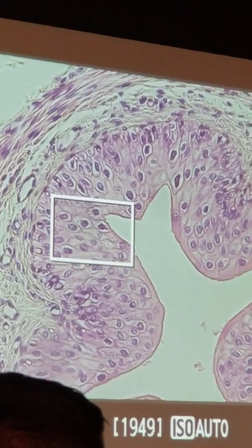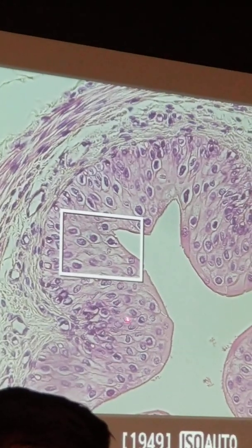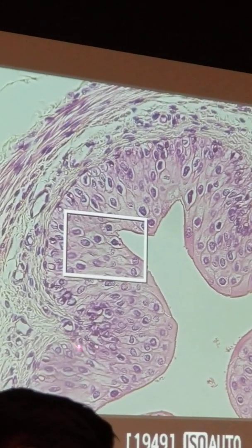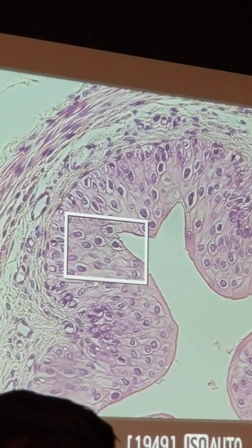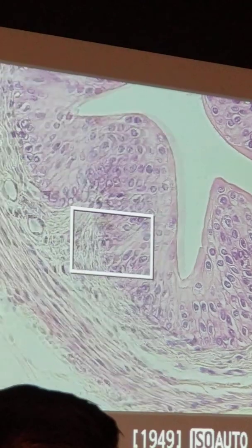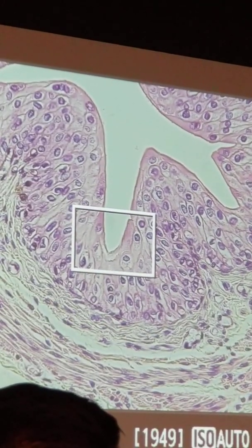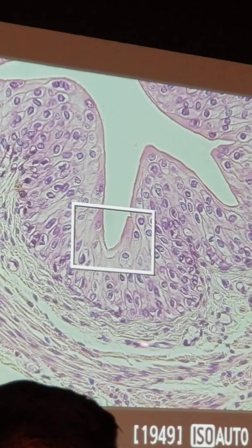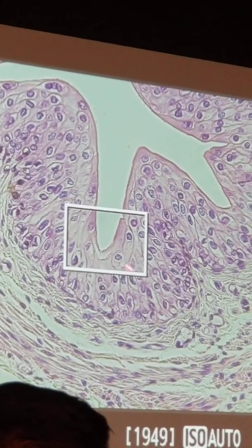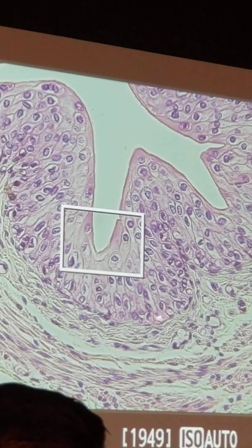So now you can see my lumen, still here, right? This is the actual transitional epithelium here, and see how this would run in a different direction? That's all the connective tissue underneath it. So I'm going to bring it down this way, where I can have the apical surface again up on top, for my drawing at least, okay? And I'm going to draw about that much of it right there, okay? Lumen, apical surface, the cells, the nuclei, basal surface or basement membrane, okay?